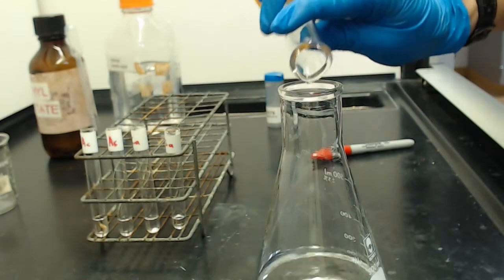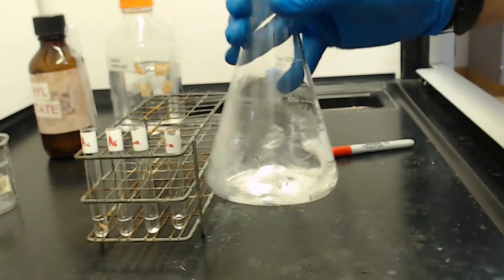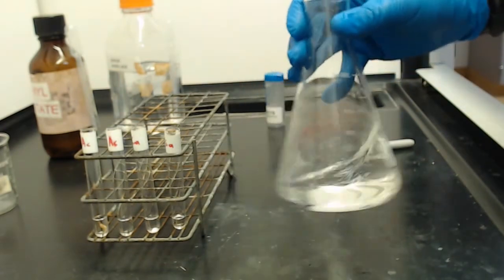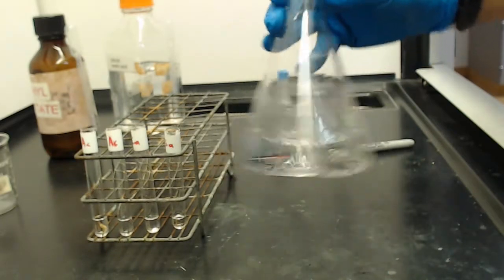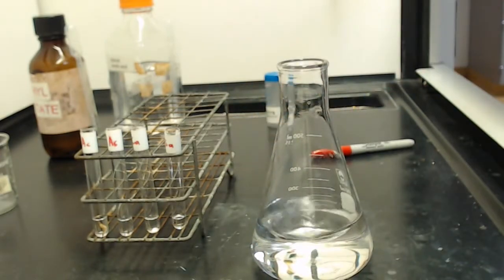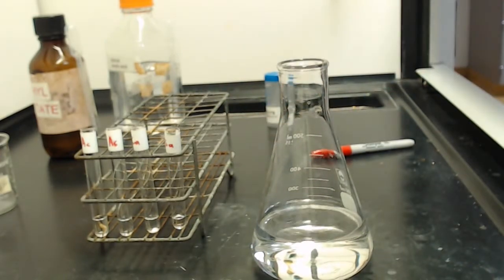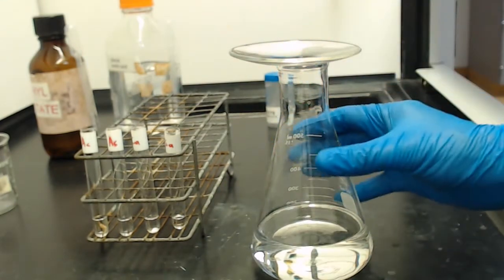If you're mixing acids and it's getting too hot, remember you can always put it on ice to help with that. Typically, if you're making aqueous acid solutions, that's more of an issue than when making them with organics. Okay, that solvent is ready to go. So that's going to be our eluting solvent for our thin layer chromatography. Need a watch glass. I like to cover it with a watch glass just to prevent any issues with evaporation.